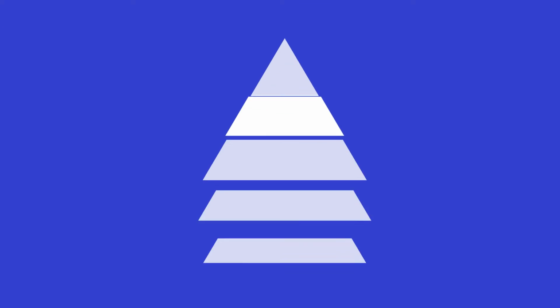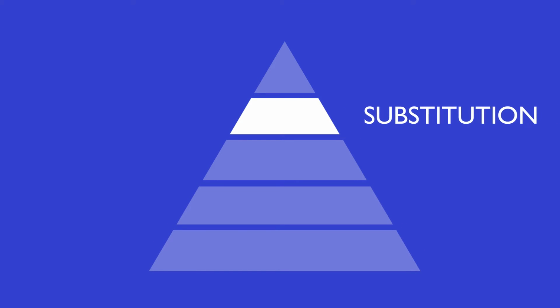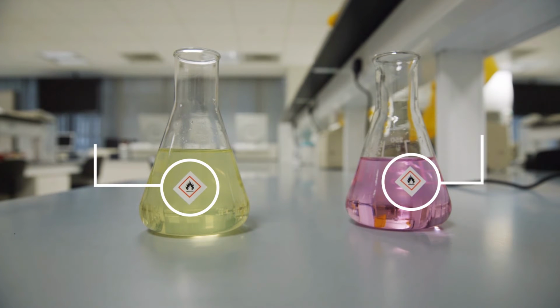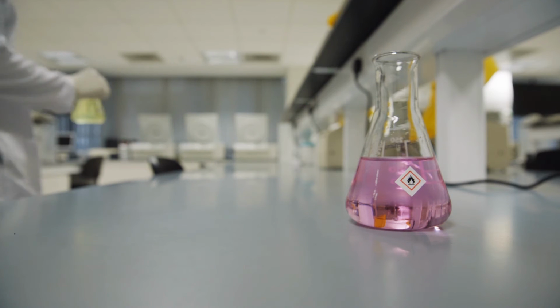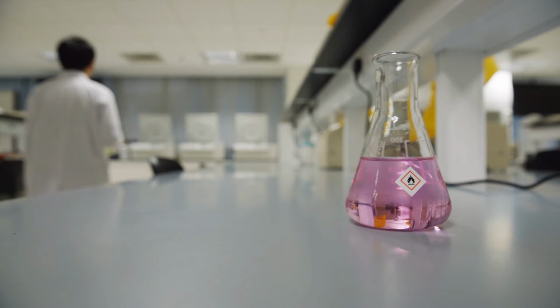The second most preferred measure is substituting the source of the hazard. For example, using a chemical that is less flammable in an experiment will reduce the risk of a fire.